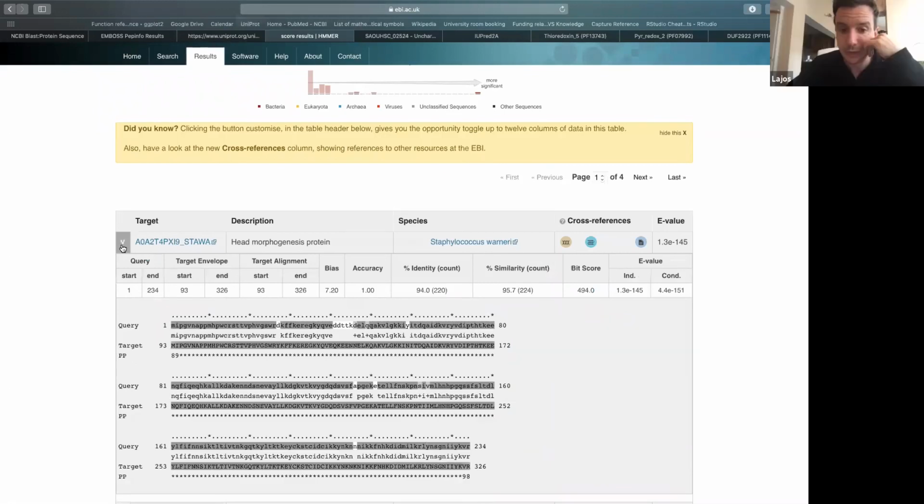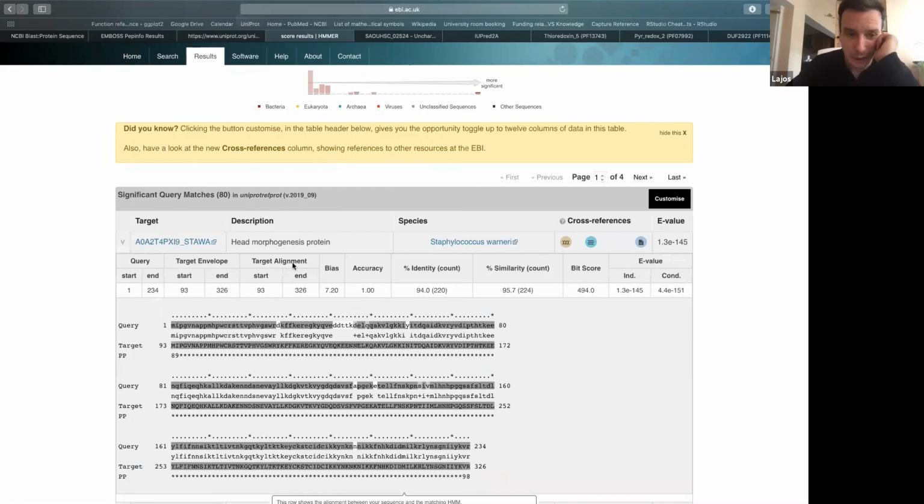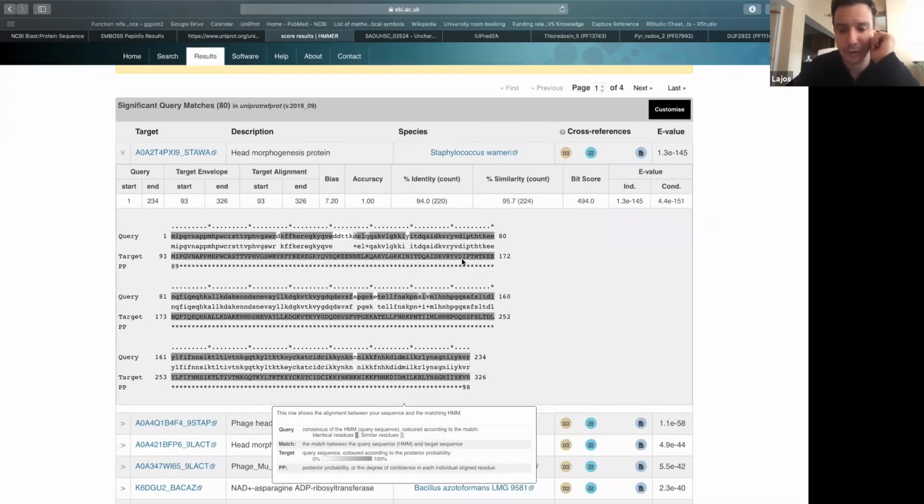So what I would really look into, especially if you open this, is that this is actually an alignment with another protein. So there are many things I would like to see. If this one is a functioning phage anywhere, maybe not functioning anymore in your Staph strain, but functioning somewhere else, then the differences in nucleotide sequence are very important. If you see that in your Staph aureus, for example, the GC content or the codon usage is much more typical to Staph aureus than to the original phage, you can also look at the nucleotide sequence of the original phage if you can find it somewhere else.